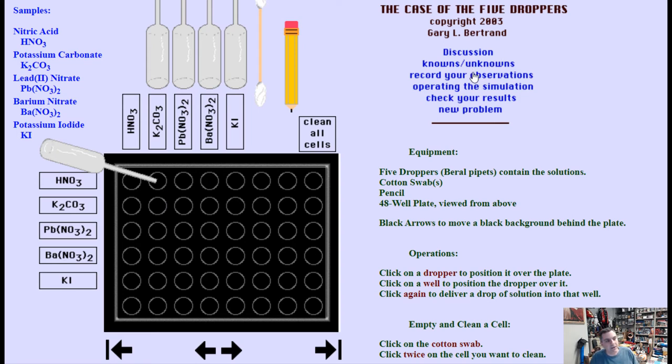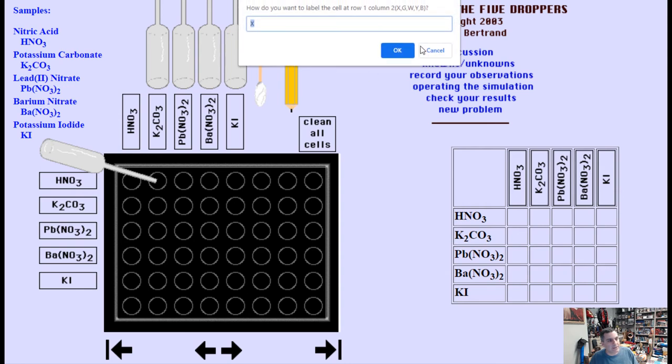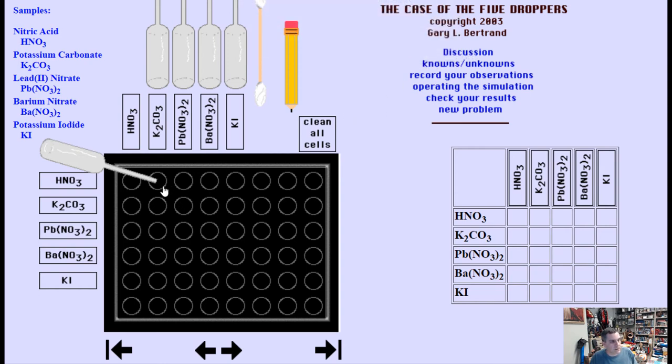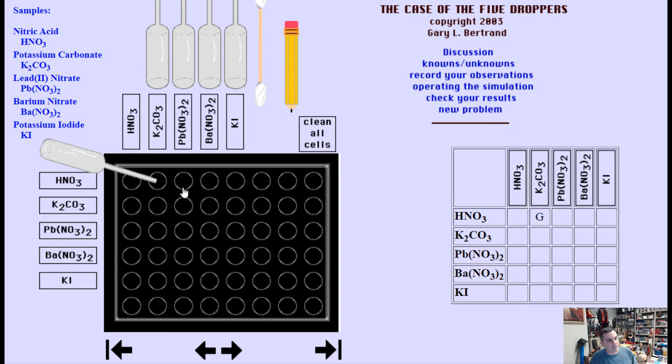So anyway, there you go, that's how you can see observations. If you want to, you can come over here and click on record your observations and you get a table. That table is matched up with the reagents, the chemicals that you have on both the columns and the rows. Here we can grab the pencil, and I think G is for gas. I had it right here, so if I click on this cell and then I grab my little pencil, I'm going to say okay, I had G for gas. And then look, it matches up. My first row, second column, I got a little G for gas or whatever you want to put.